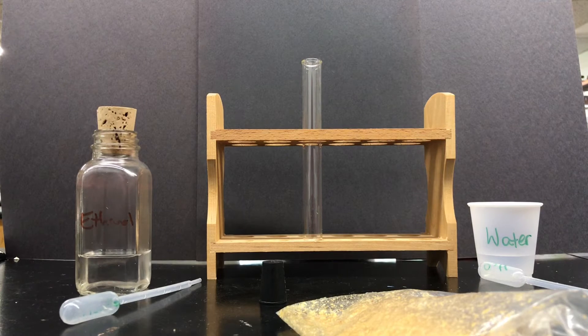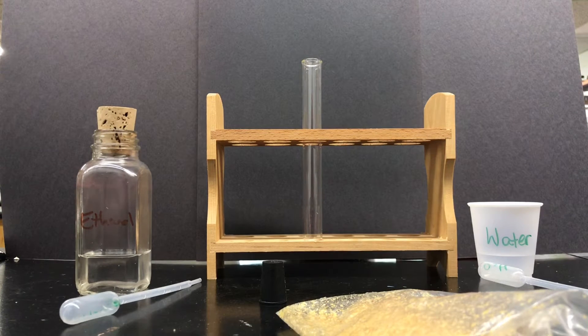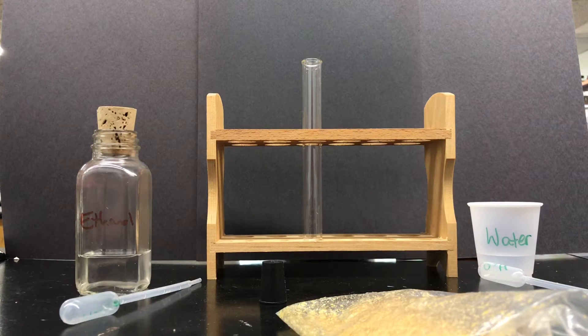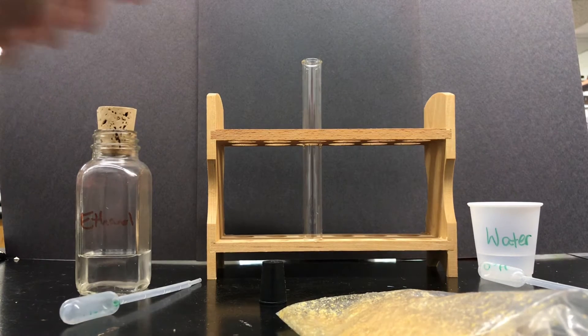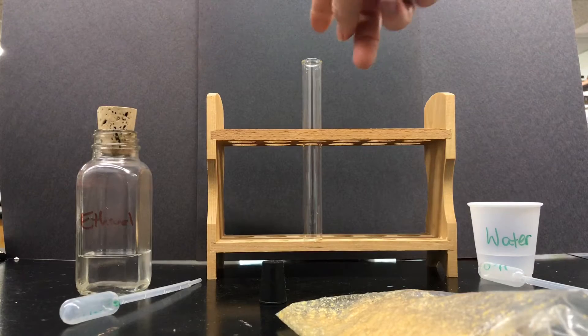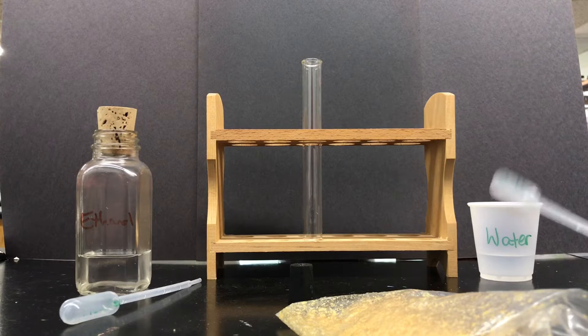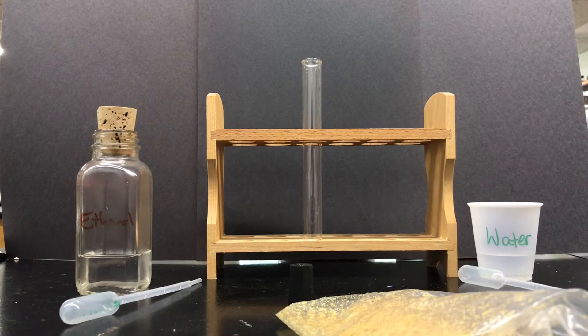To test a sample to see if it has lipids we perform something called the emulsion test. For that we are going to need ethanol, test tube, a rubber stopper, water, and a pipette designated for the water and a pipette designated for the ethanol and a sample.